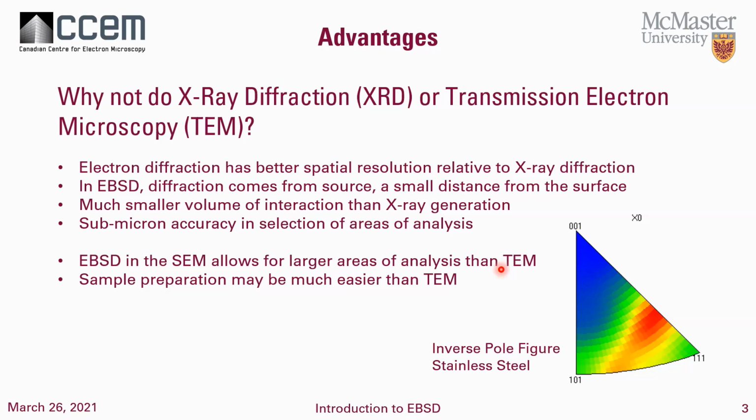When it comes to the benefits of doing this instead of TEM, we can also do large areas of analysis. So you can do things with large area scanning and doing mosaics of the data.